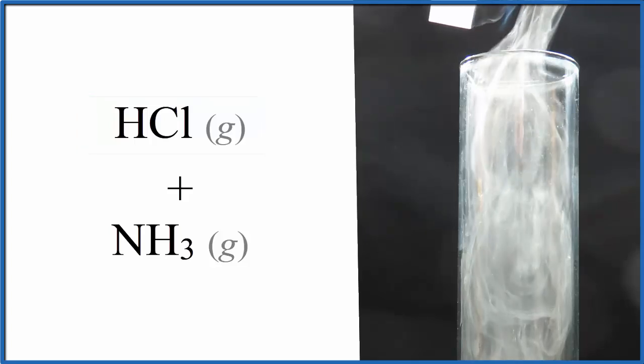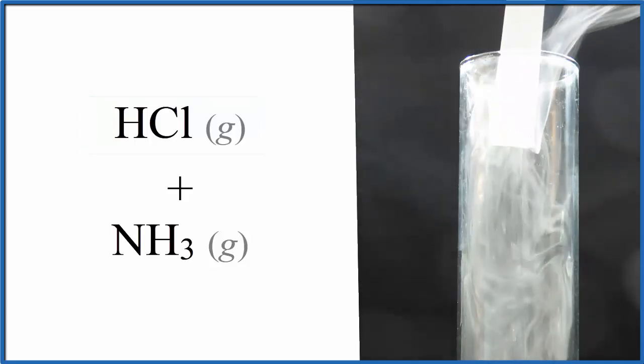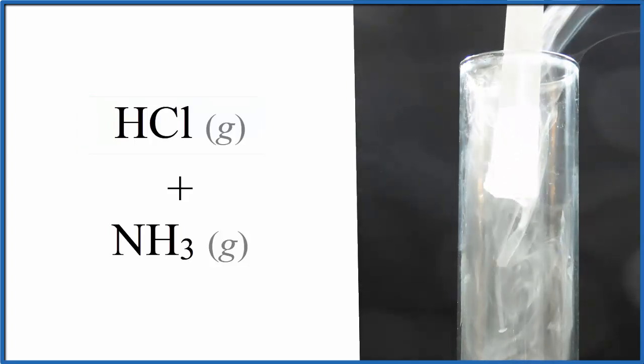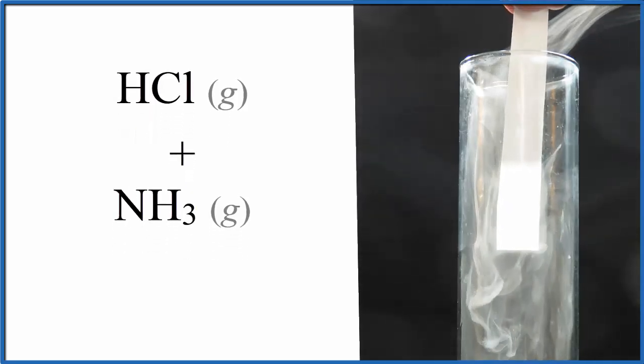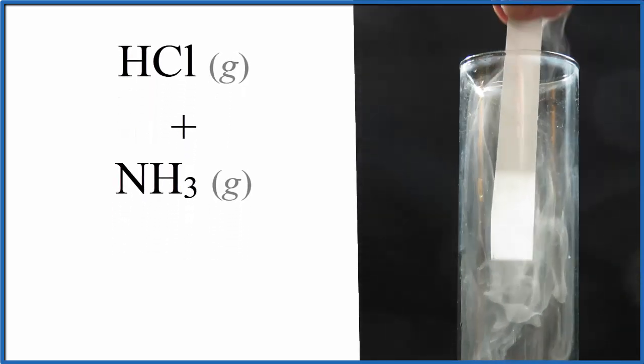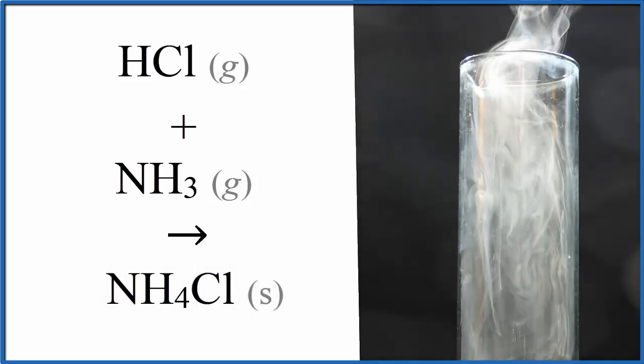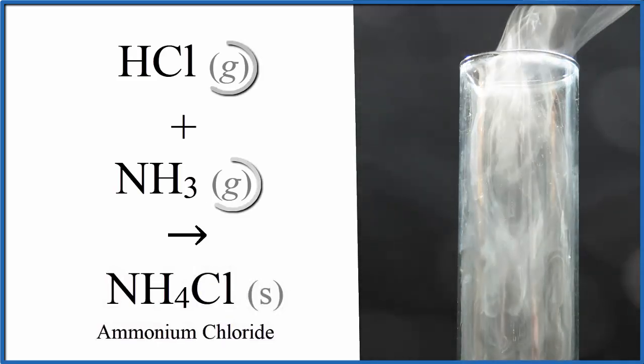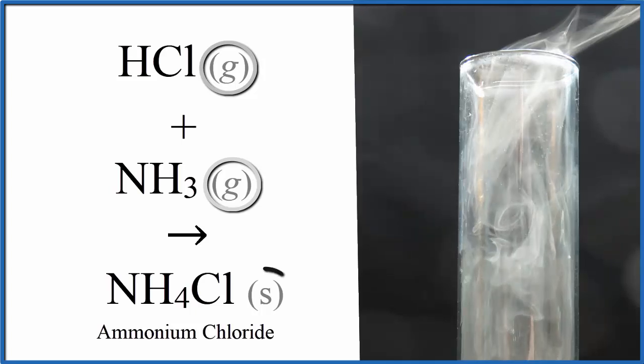So immediately when those two gases hit each other, they start mixing, we see this white smoke-like substance. That smoke-like substance, that's a solid. It's very small crystals of what we call ammonium chloride. So the two clear gases, they've come together and they've made this solid.